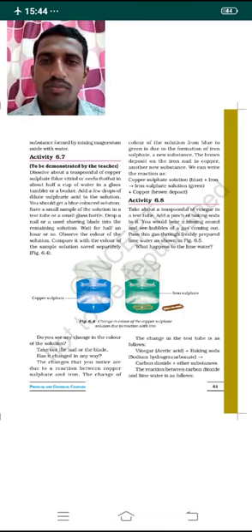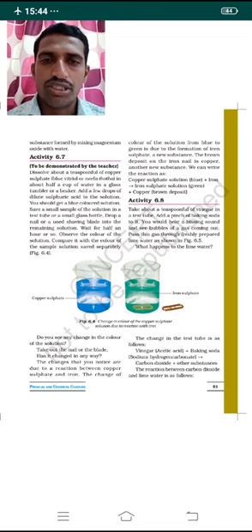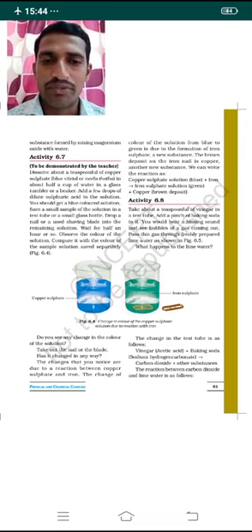Okay, so dear students, let us go for the next concept, one more chemical reaction, chemical change, in today's class. Let's go for activity 6.8. In this reaction, you need to take about a teaspoonful of vinegar in a test tube. Vinegar, as I already explained in the lesson acids, bases and salts, is acetic acid. It's an acid.